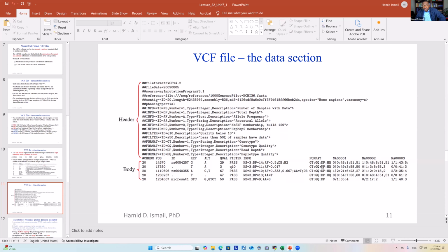So how the genotype is formatted, and by genotype, it means the genotype of our genome, how it differs from the reference genome. Okay, so this is the genotype or the allele. Later on we'll talk about the alleles. But if you see here the genotypes, this is the format of how they look. This is only the format, but the values are right here.